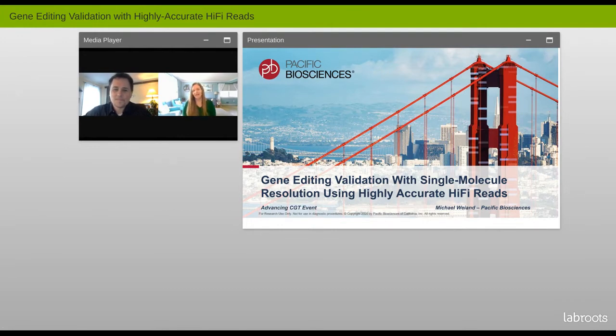Our talk is entitled Gene Editing Validation with Single Molecule Resolution Using Highly Accurate HiFi Reads. And today I have Mike Weiand joining us from PacBio. Before we get started, if we can just have a little bit of an introduction on AAV.